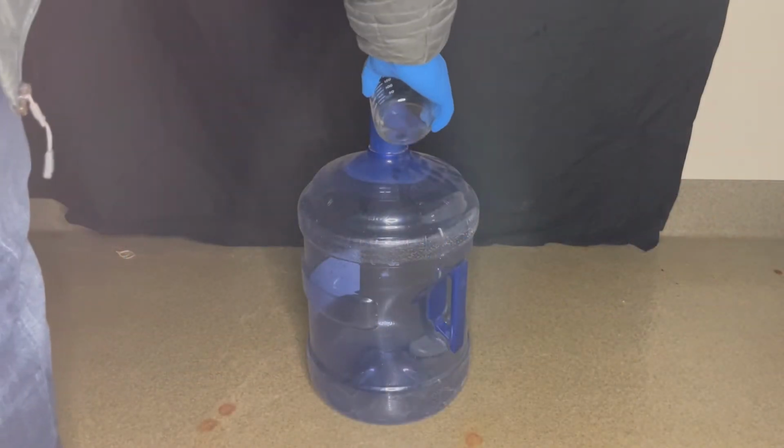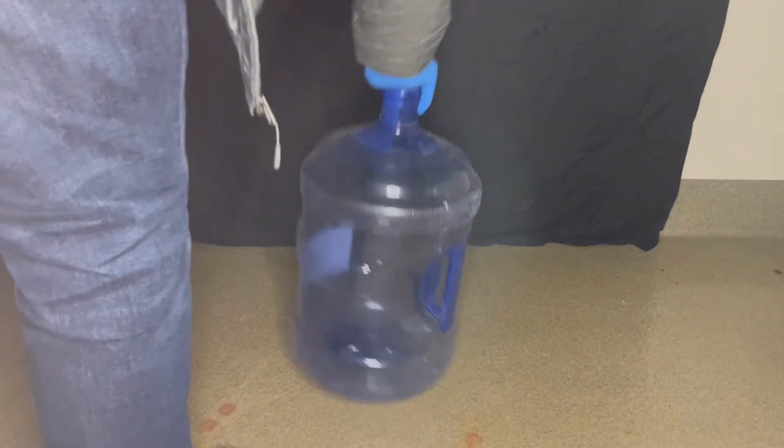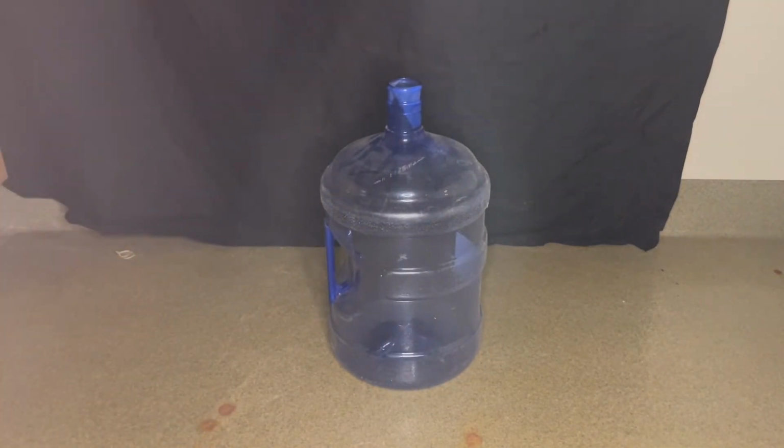A common demonstration, known as the methanol Whoosh bottle, shows the combustion of methanol vapor very dramatically. To perform it, I add 40 milliliters of methanol to a plastic jug, then swirl the methanol in the jug to coat the surfaces and allow it to fully vaporize. Then I dump out the remaining liquid and light it with a flame. The flash point of methanol vapor is 11 degrees Celsius, so you'll see that it goes off right away.